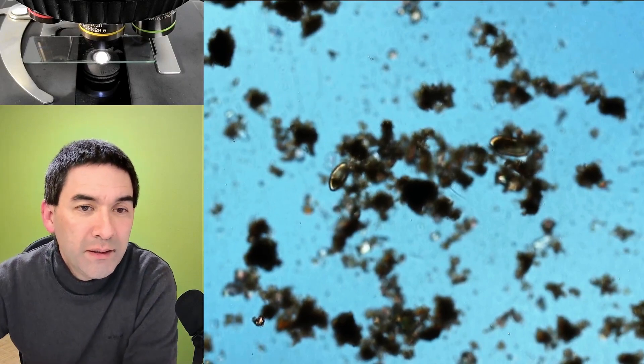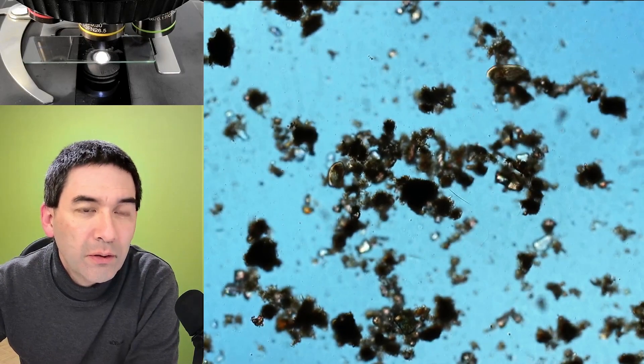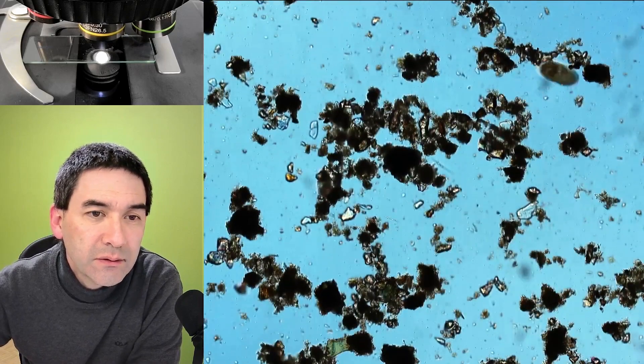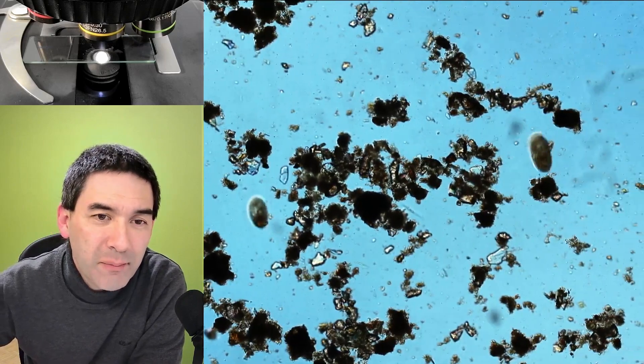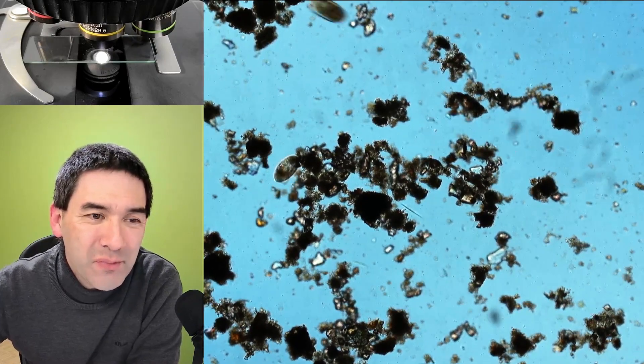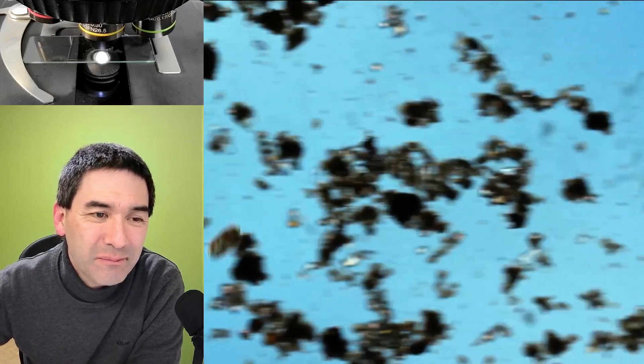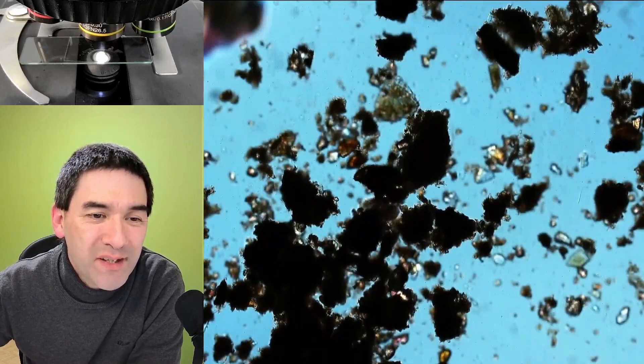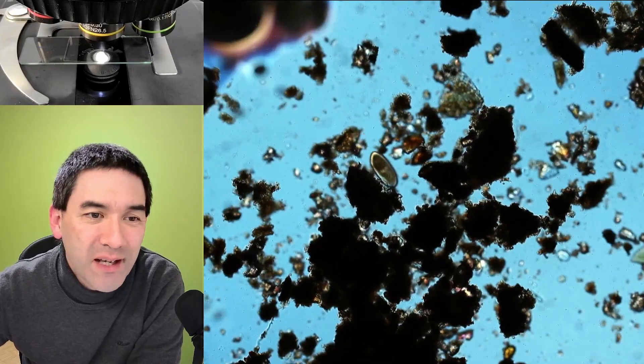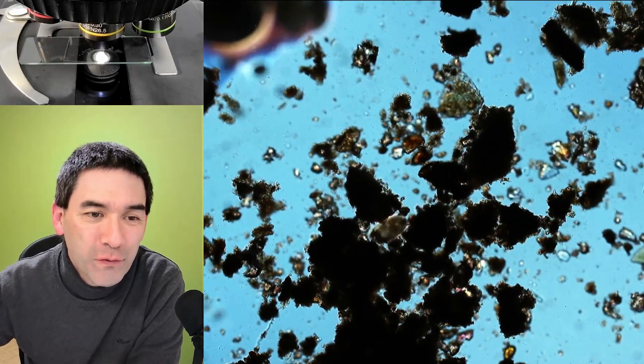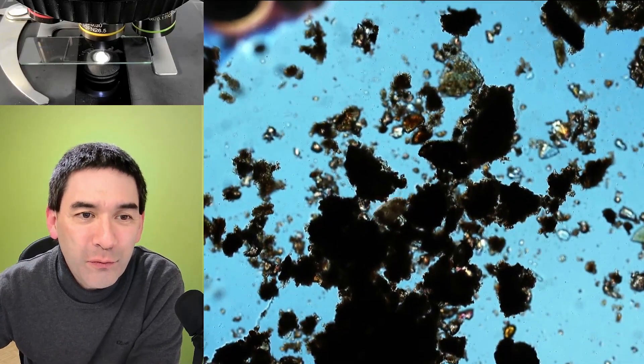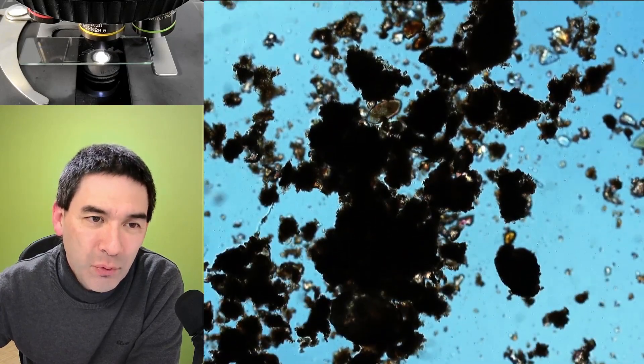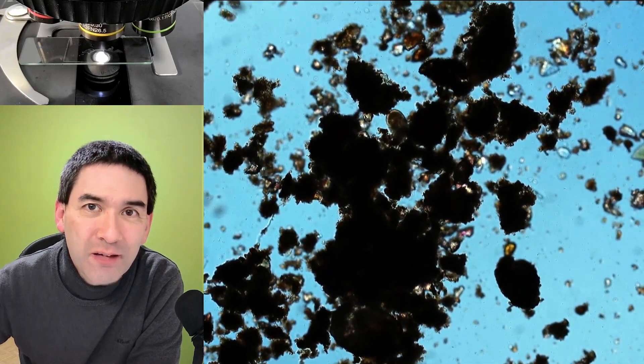And it didn't take long, here look there are already two ciliates here. You see that even in winter time there are microorganisms obviously alive living in the so-called interstitial spaces of the sand. These are the spaces between the sand grains, large surface area of course, plenty of food, and maybe I'm going to go up a little bit with the magnification, let's have a closer look.